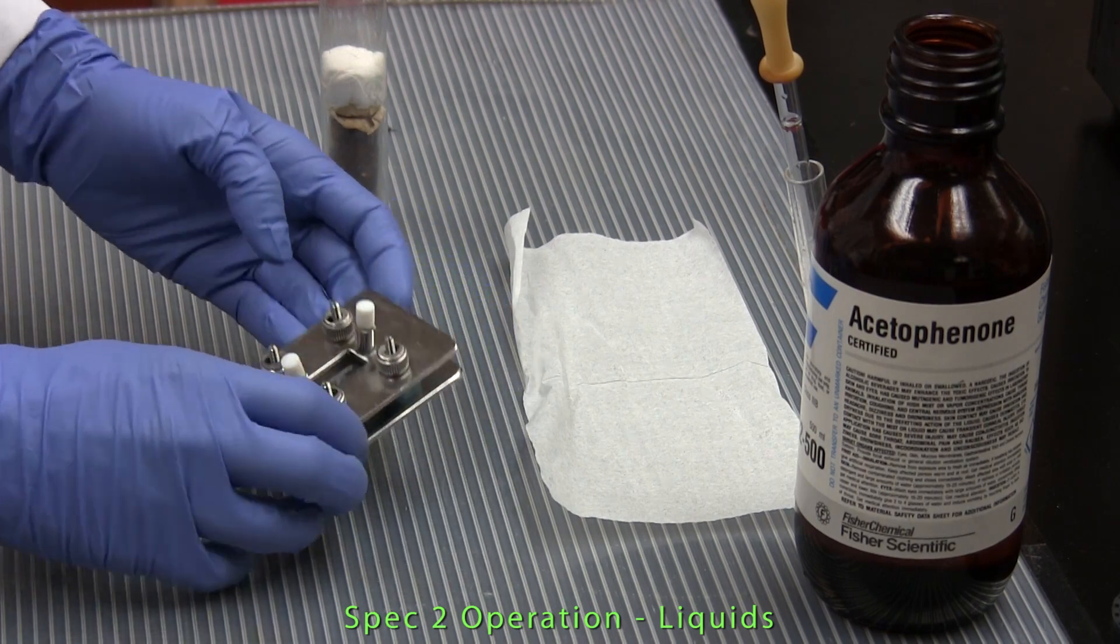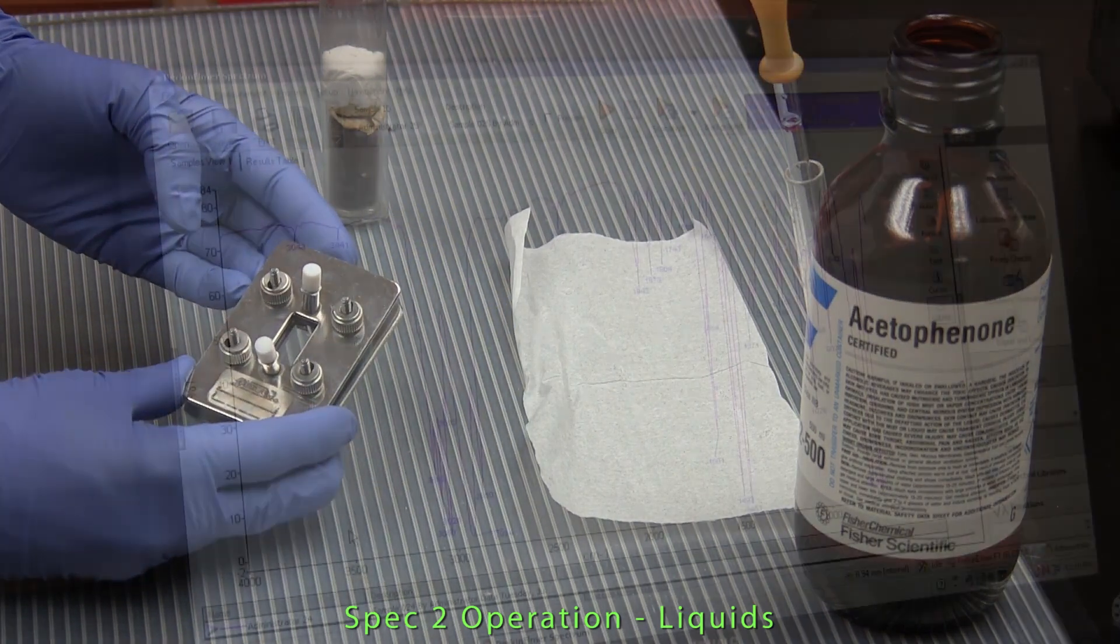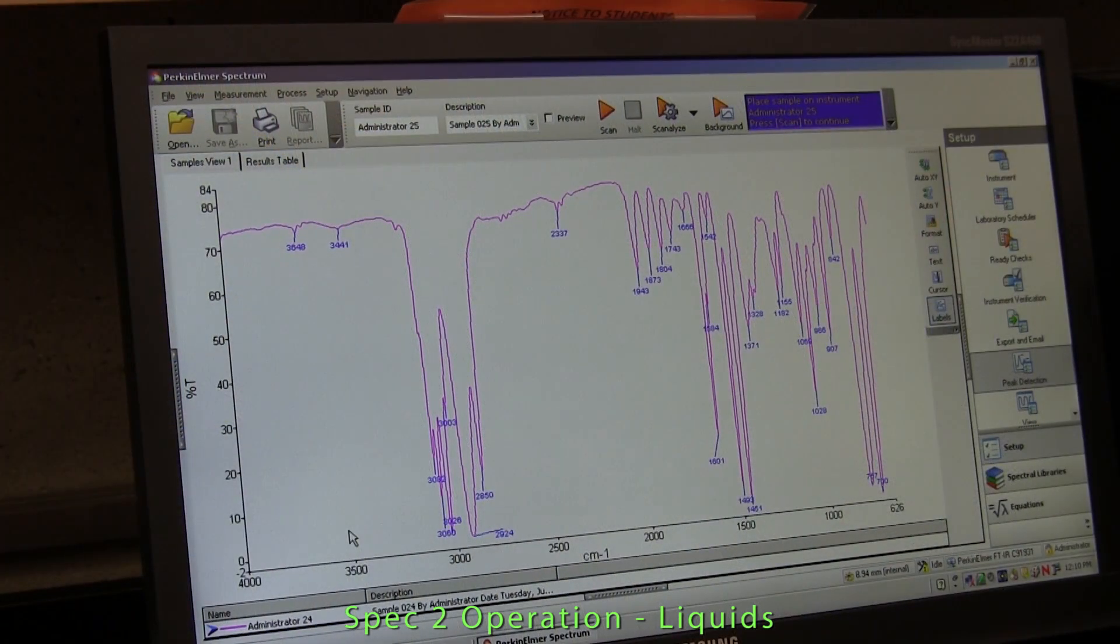We're now ready to obtain the IR spectrum of the liquid. Now in most cases the graph area of the spectrum window will show a spectrum of a sample from a previous user of the instrument. The graph area is cleared.